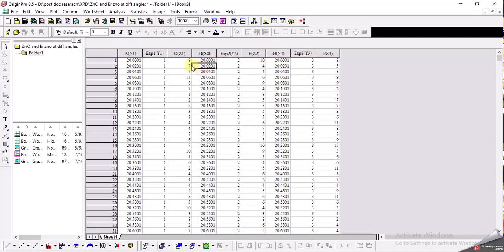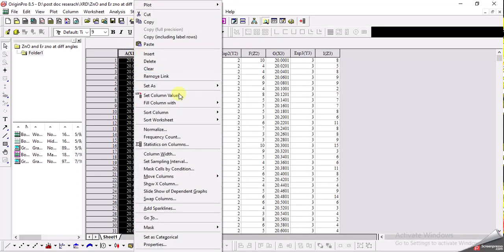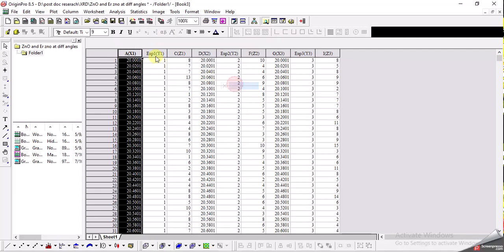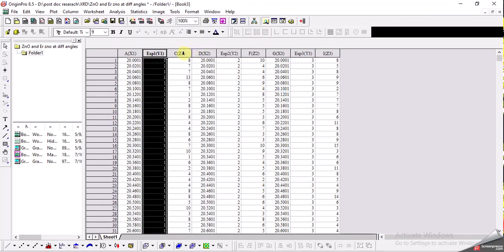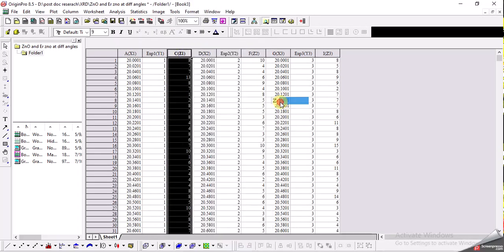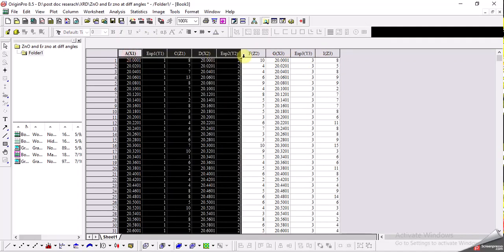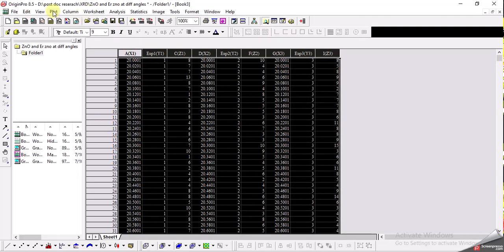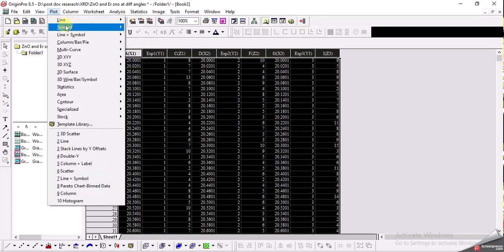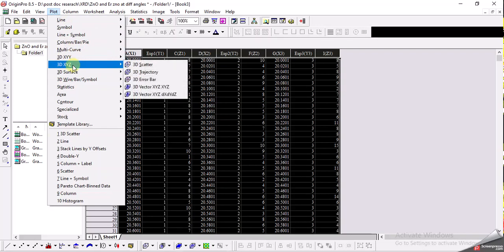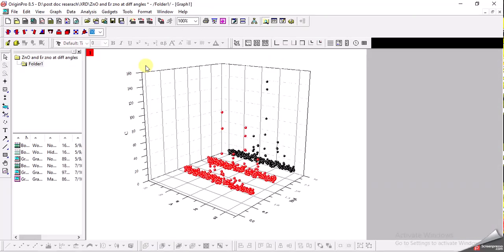The next important thing is that you should always set the labels of the columns: this one must be set as x-axis, this one as y-axis, and this one as z-axis. Similarly set x, y, z for the second sample and x, y, z for the third sample. Then select all the columns, go to Plot, go down to 3D XYZ, and select the 3D scatter option.